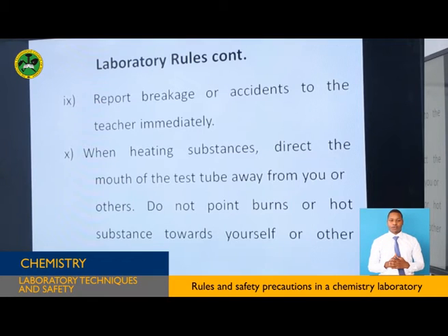When heating substances, direct the mouth of the test tube away from you or others. Do not point hot substances towards yourself or other people.